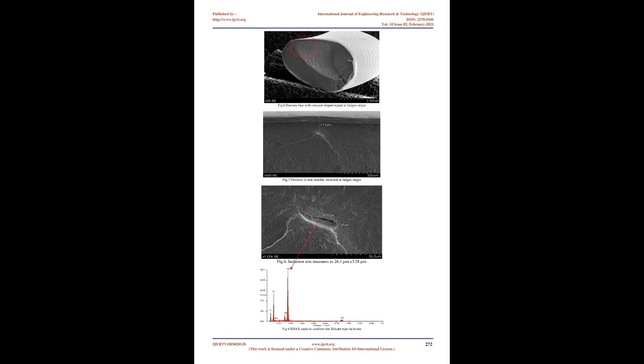Closer look at the fracture surface reveals the presence of some foreign particle at the fatigue origin point, and radiating ridges emanating from this point suggest fatigue failure caused by cyclic loading during the service 7. At the fatigue origin, the spring surface was found to be free from any of the possible mechanical damages, tool marks, or any material surface defects like crack or lap as mentioned in 2.1 and 2.2 above. Scanning electron microscopy. The fracture specimens are cleaned ultrasonically to remove the contaminations.